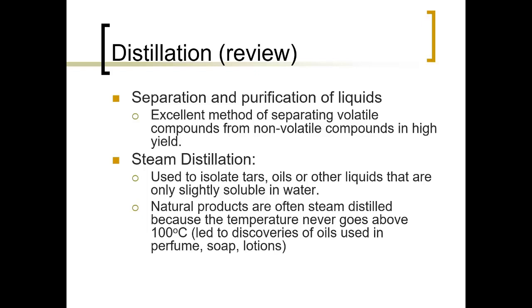But because they don't dissolve in the water very readily, we actually can boil them off because they're slightly soluble. Almost everything is slightly soluble in water at high enough temperatures that we're going to boil our water off, and that water is going to carry the oil with it. Now, it's only going to be a little at a time as it's happening because, again, clove oil is not very soluble in water. And so we form what's called an azeotrope. It's something that the water and the oil are mixed together and they come off together.